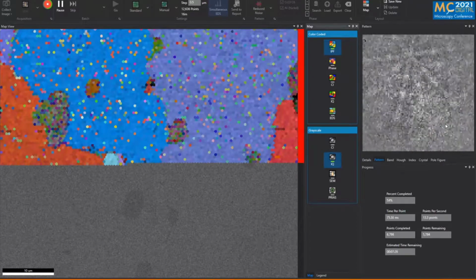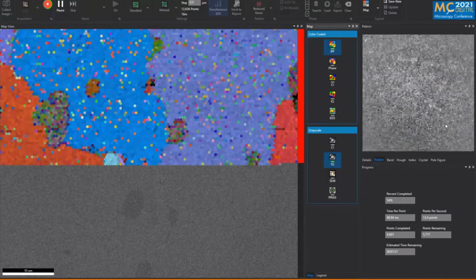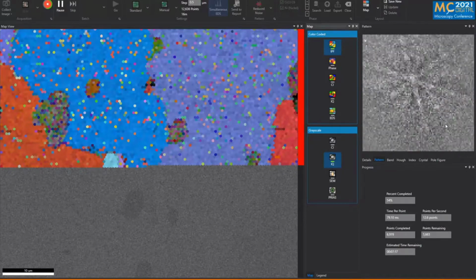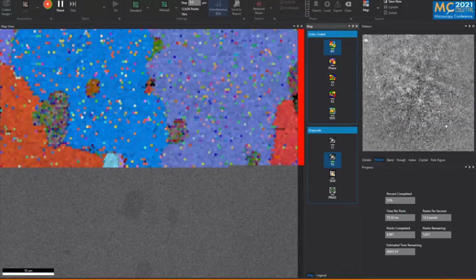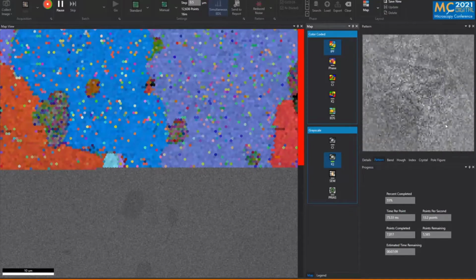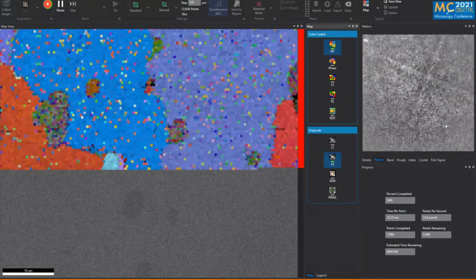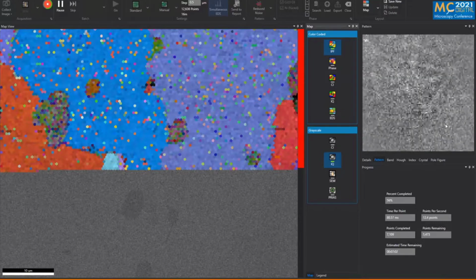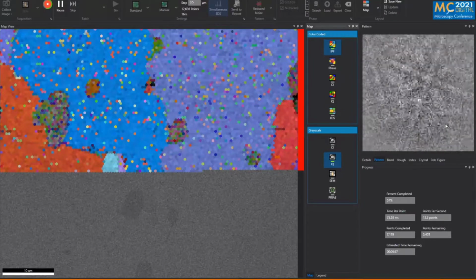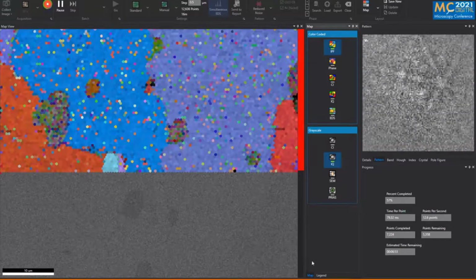So in order to improve that, we would really have to increase the beam current, or as we can do in a moment, we can apply NPAR to improve that as well. In some cases, just re-indexing and stretching the contrast a little bit more is already sufficient, and you don't have to do the averaging, but in this case we can. So I'm just going to stop this scan.